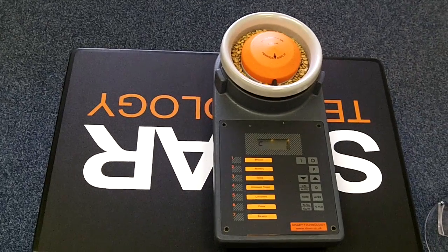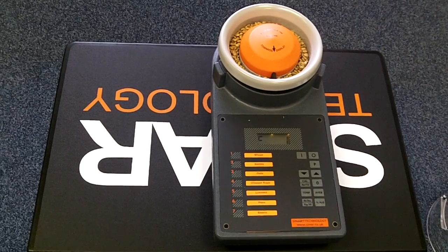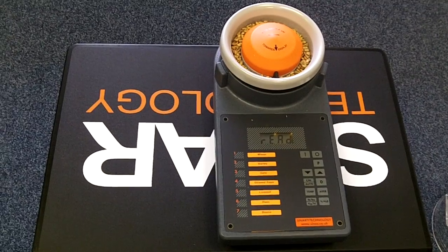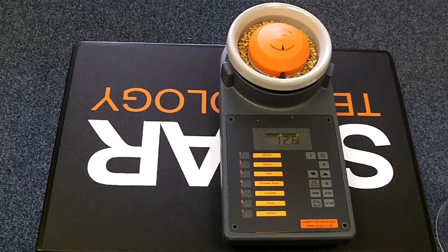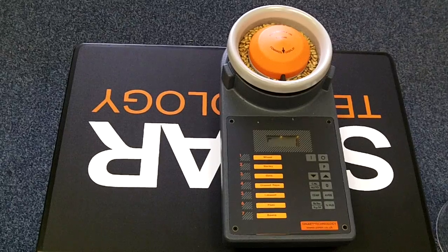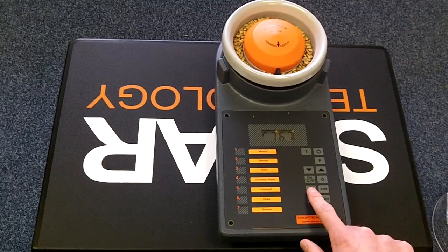To take a moisture reading press the %H2O button. To take a hectolitre weight reading press the kg per hectolitre button. And to take a temperature reading press the temperature button.